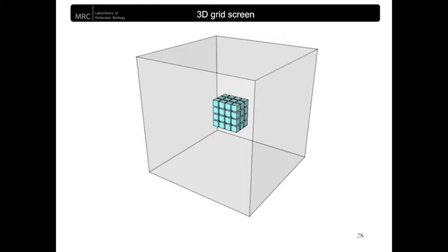Because of the very large number of reagents well suited for crystallization, an extensive grid screen will include millions of combinations. This is technically not feasible, notably because of the limiting amount of sample. Subsequently, most developments of initial screen are based upon minimizing the number of initial conditions.